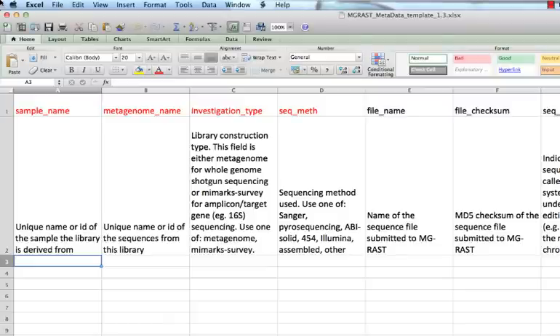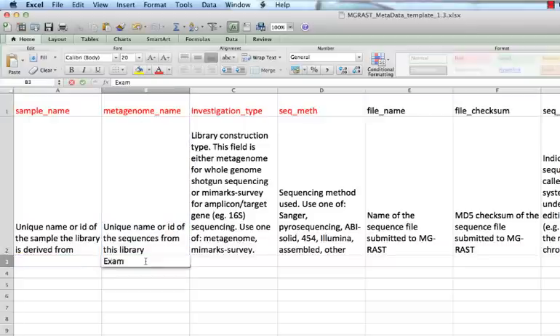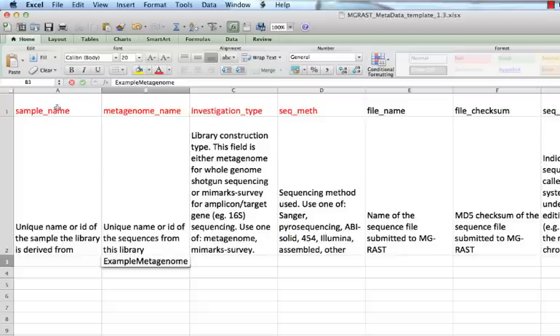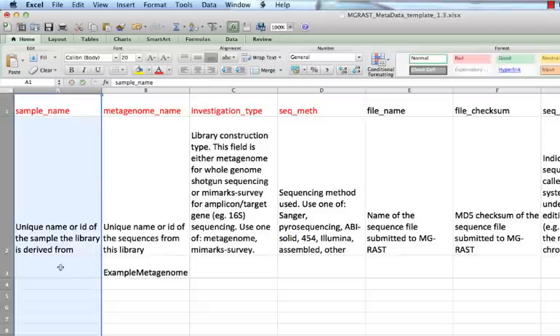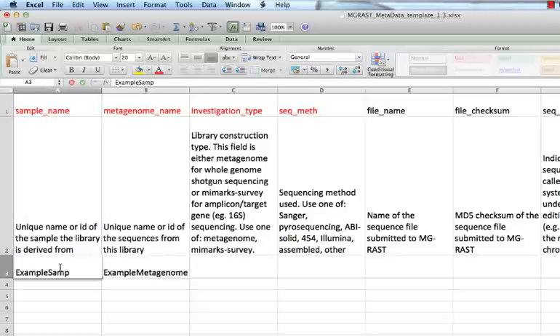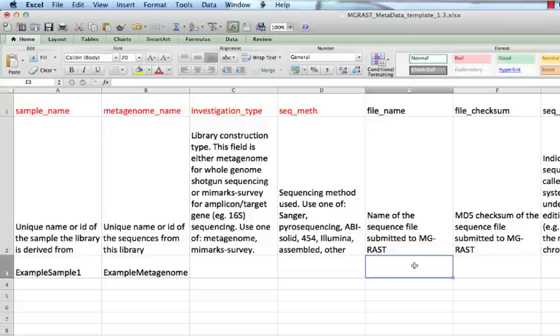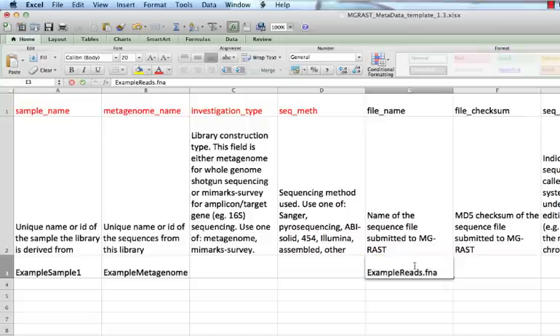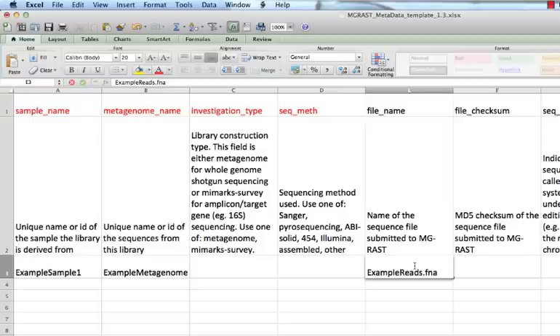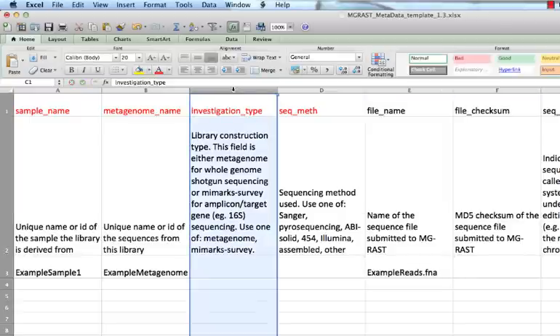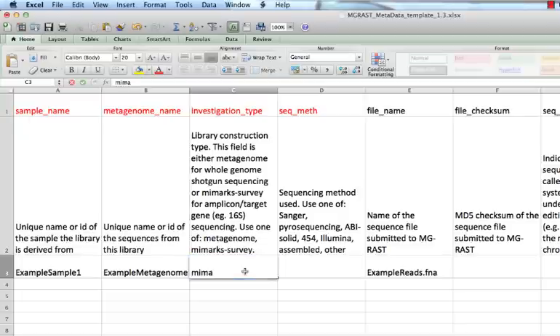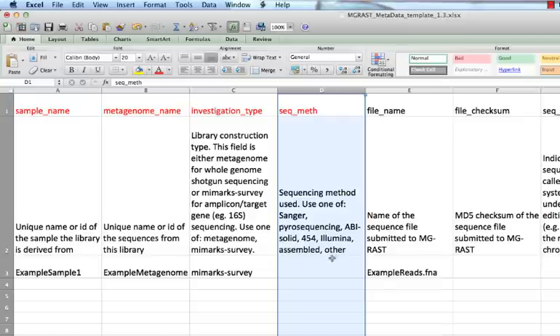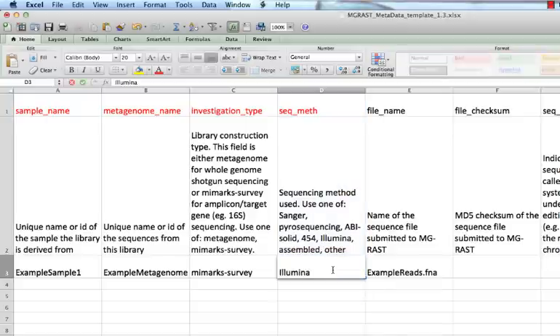You should complete one row per metagenome. If your sequence files are not multiplexed, then you will have one row per sequence file. Give a descriptive name to each metagenome and specify the experimental sample it originates from, using a sample name that you previously assigned on the sample sheet. Specify the sequence file in which reads for the metagenome are recorded. The file example reads dot fna has already been uploaded to MG-RAST for purposes of this demonstration. On this library sheet, always enter MiMarks Survey for the investigation type field. On the Library Metagenome sheet, you would enter Metagenome in the corresponding field. For sequencing method, choose one of the alternatives in row 2.